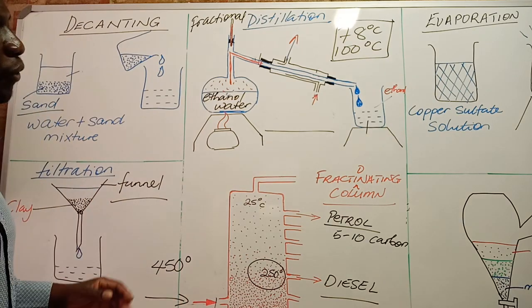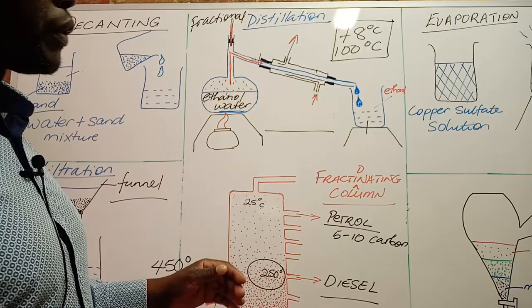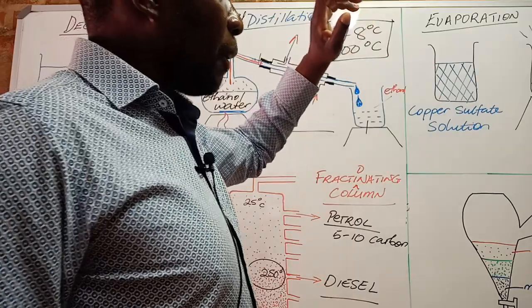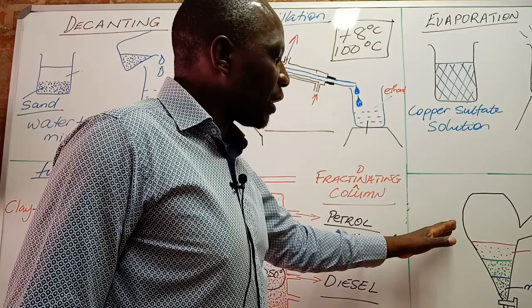And from here, we are going to discuss the last two separation methods: separation by evaporation and separation by use of a separation funnel.